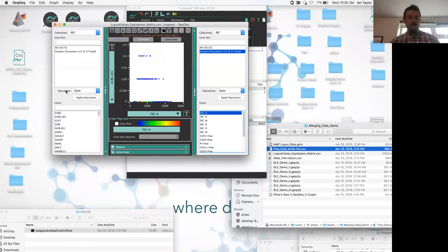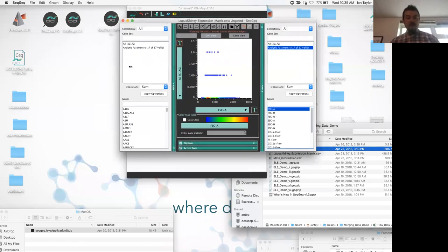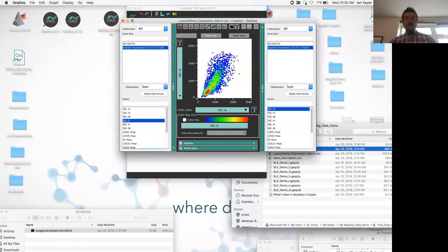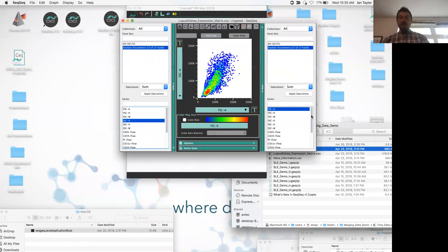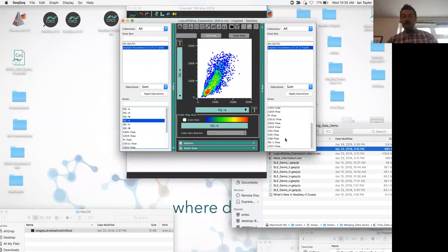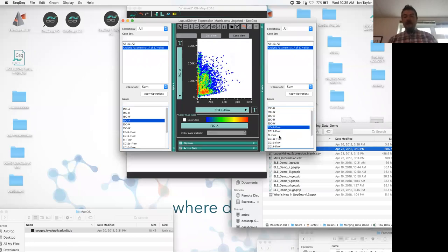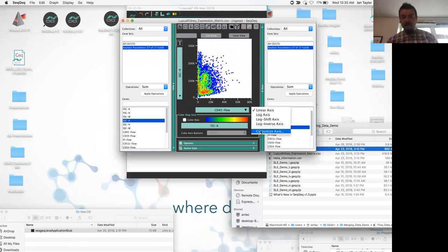We can view a couple of scatter parameters to see that the data was nicely gated prior to performing sequencing. We could gate on the densest portion for a size gate if we wanted to, but I'm happy with what they've done here. We also have flow parameters — actually 11 different fluorescent channels — and they all need rescaling.